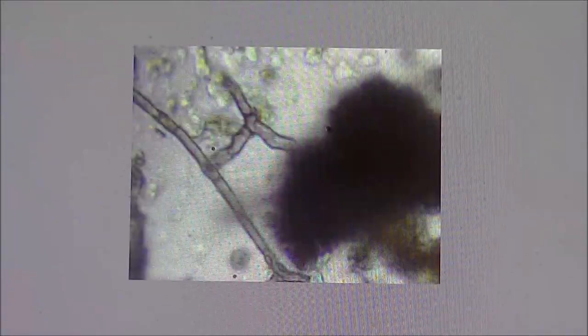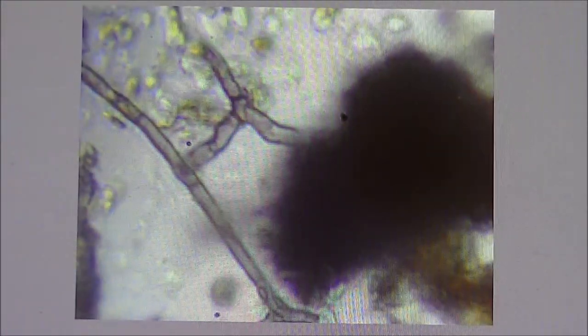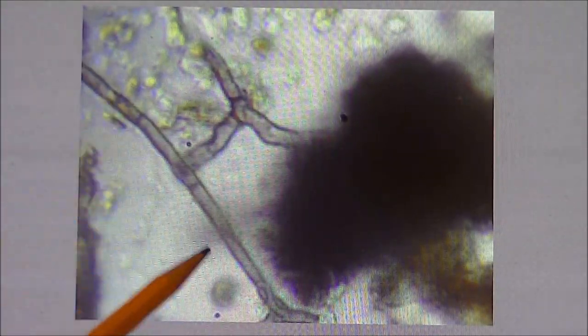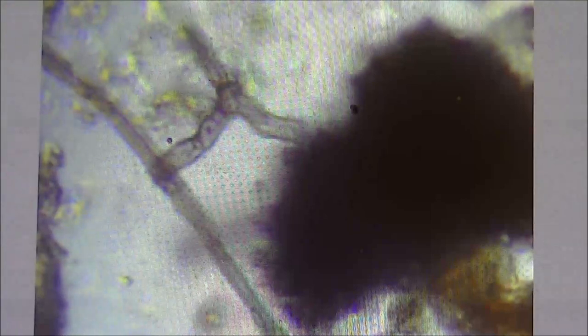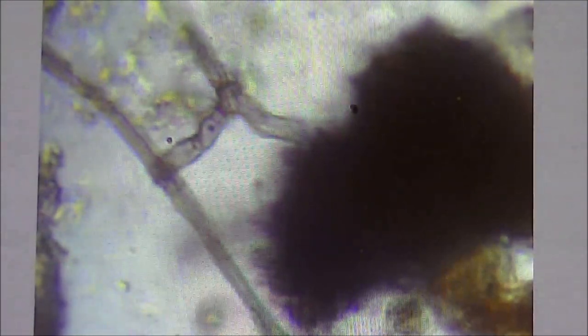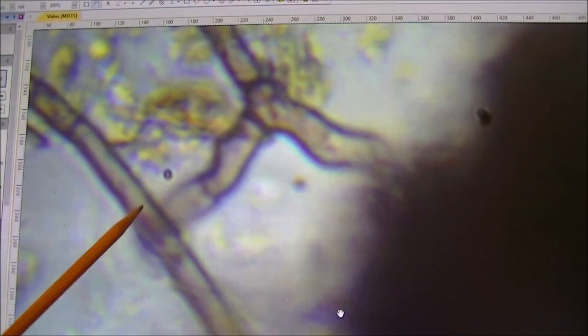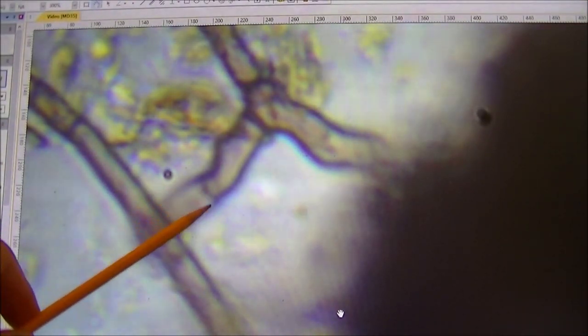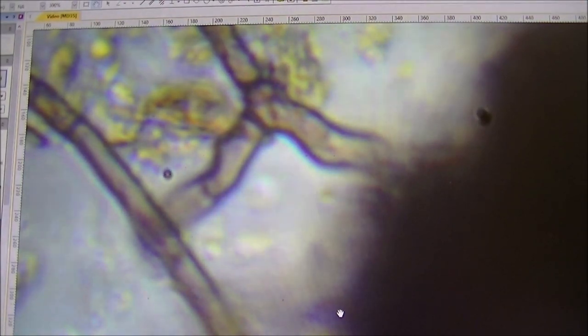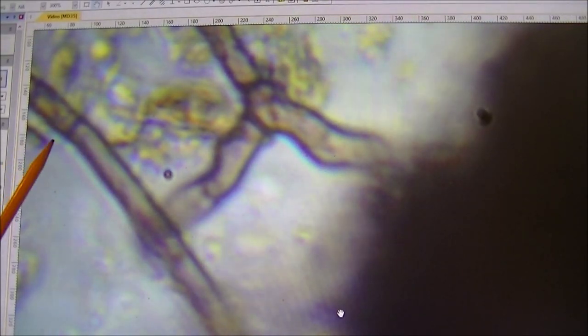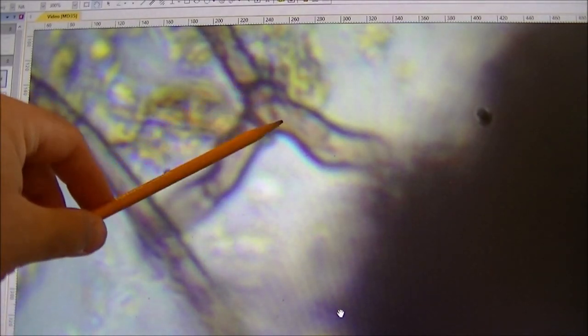So here's something also very interesting. This H shape that we have right here, that's fungal hyphae. This is good to know because we're not just bringing in bacteria which is all the movement around in the background, we're also bringing in that good fungal dominated part of the worm castings. You know it's fungi because of the breaks here. That's how it grows. A plant root does not have that. This is decomposing fungi only, this is not mycorrhizal fungi because that needs a living plant root, and there's no living green specimen growing inside my worm bin. So this is just regular decomposing fungi, and you can tell by these breaks or segments here.